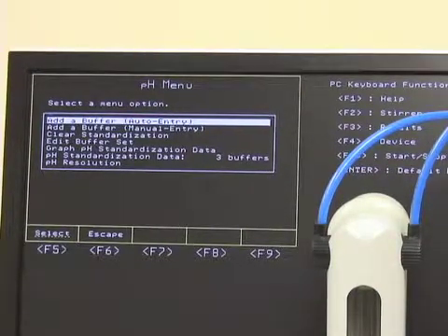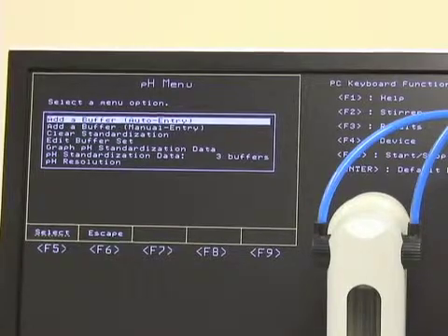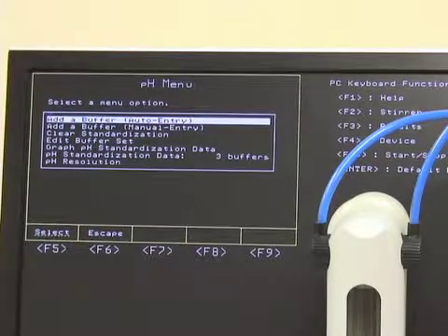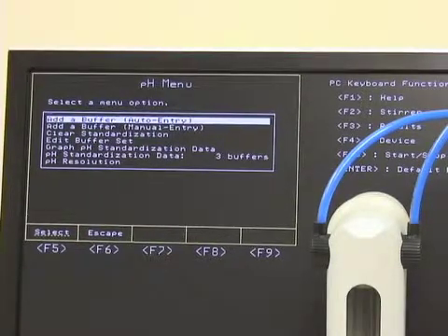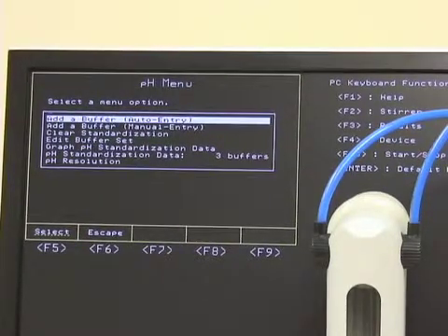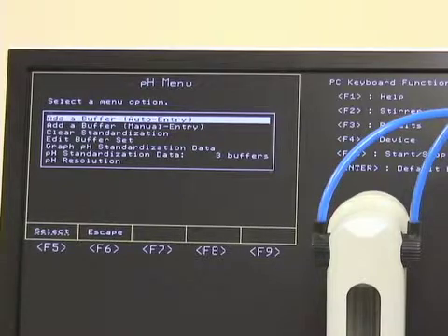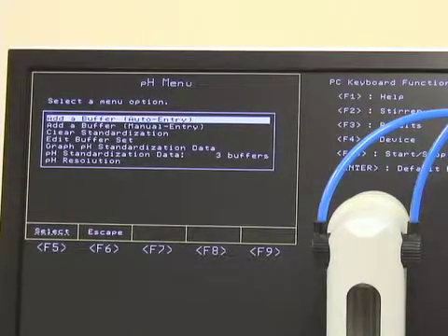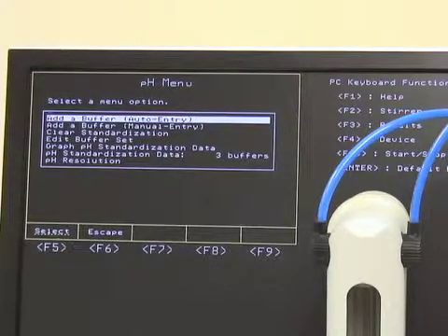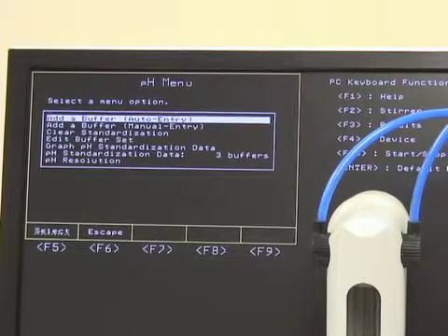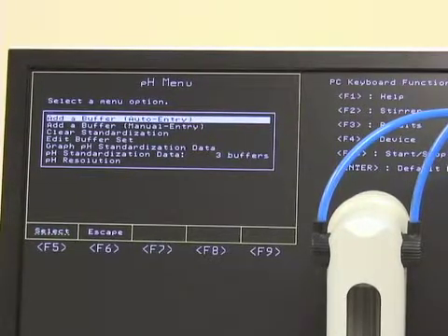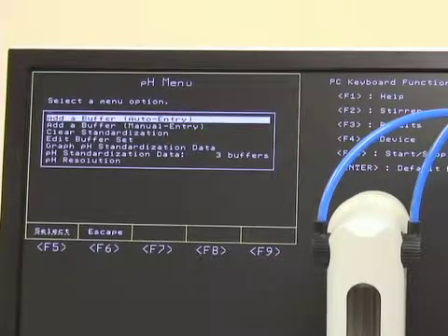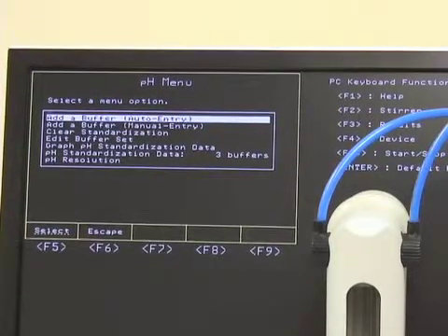Graph pH standardization data will just show you your slope. Under pH standardization data, you can see we have three buffers — this is where it stores your buffer information, including the last time you calibrated and which buffers you used. The final option is pH resolution.